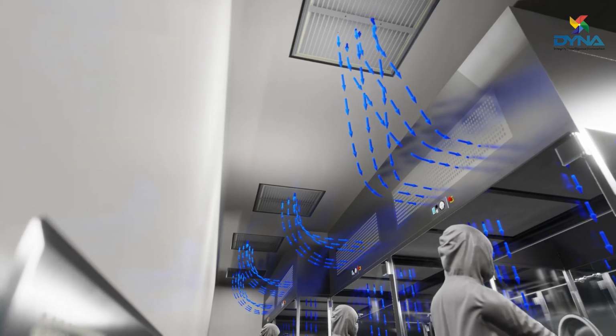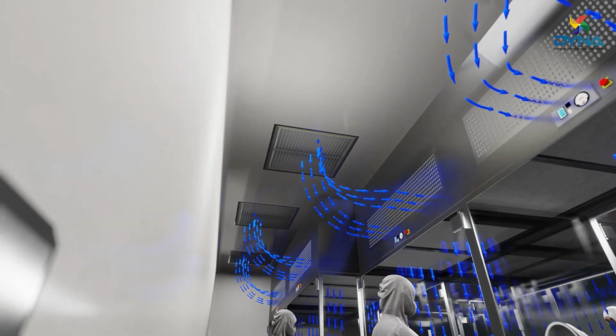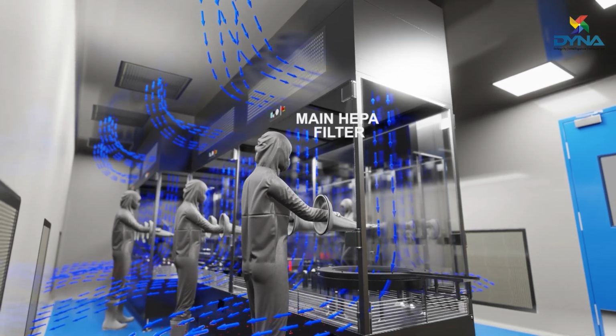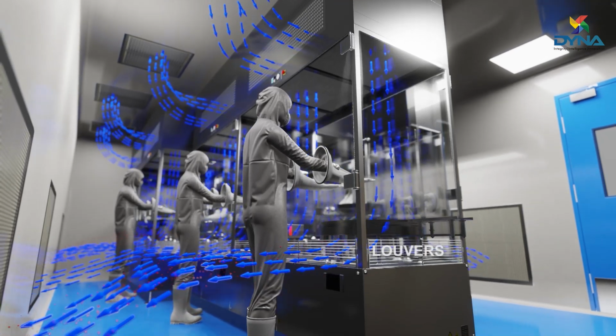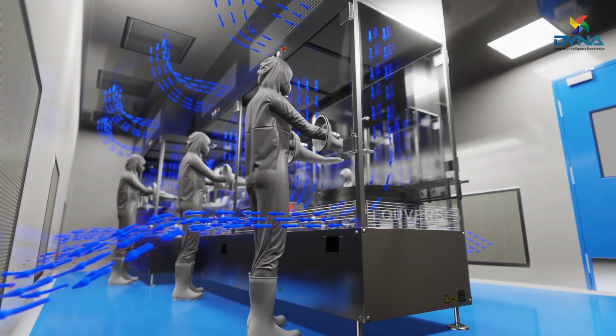The air is then allowed to enter the laminar airflow unit after passing through a pre-filter located on the sides of the laminar airflow unit. This pre-filtered air undergoes further filtration through the main HEPA filter before being supplied to the work area. The airflow within the work area is allowed to exit through the louvers located beneath the work area.